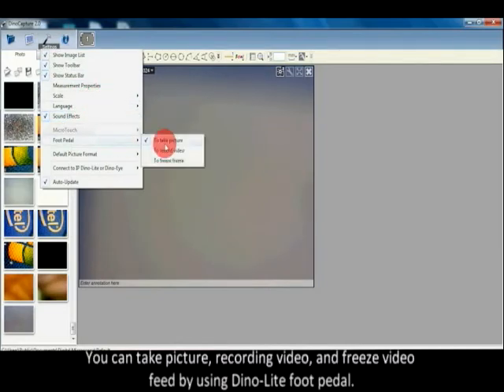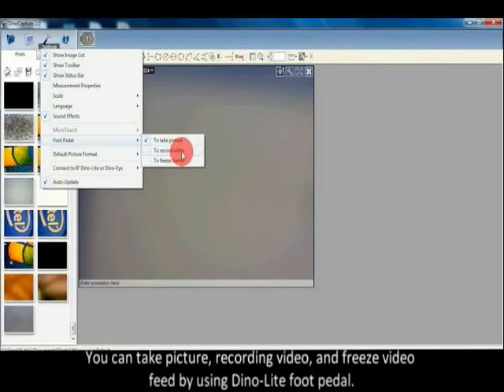You can take pictures, record video, and freeze video feed by using the DinoLite foot pedal.